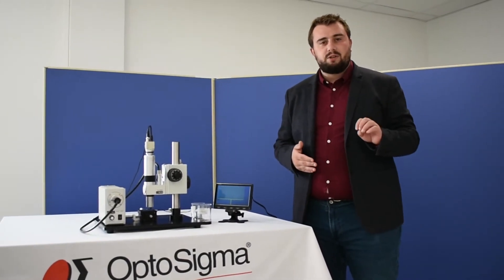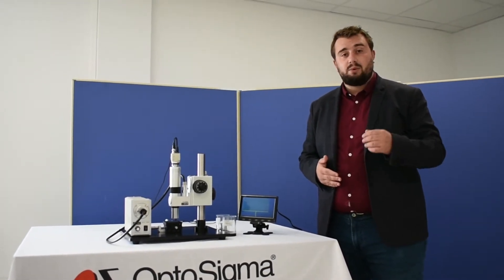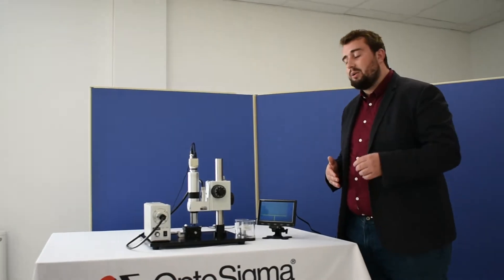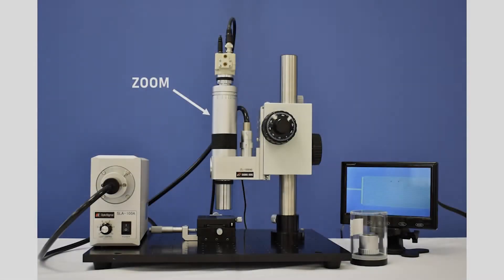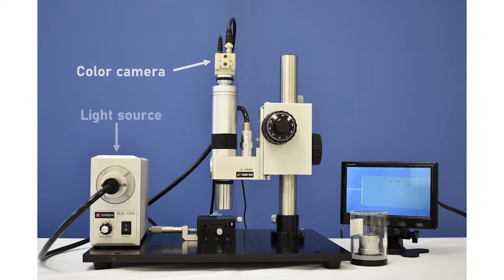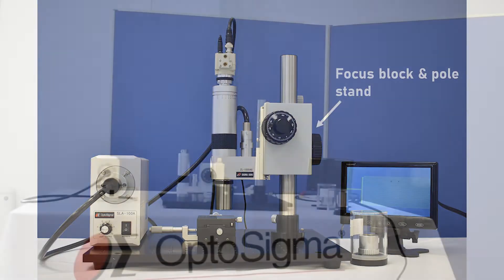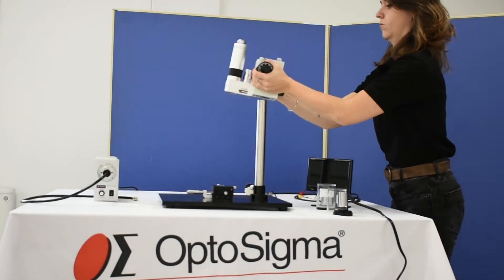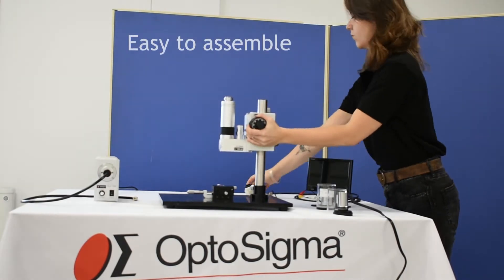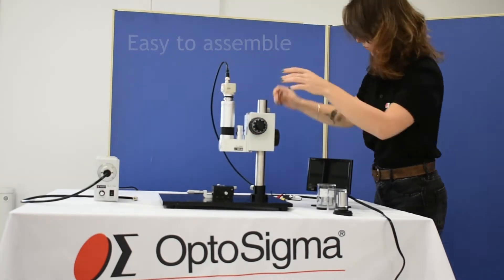It's a fully modular system, allowing you to do quick and easy analysis of the samples. Come on, let's take a closer look. Very easily assembled, this system can also be integrated directly into your machine and your process.